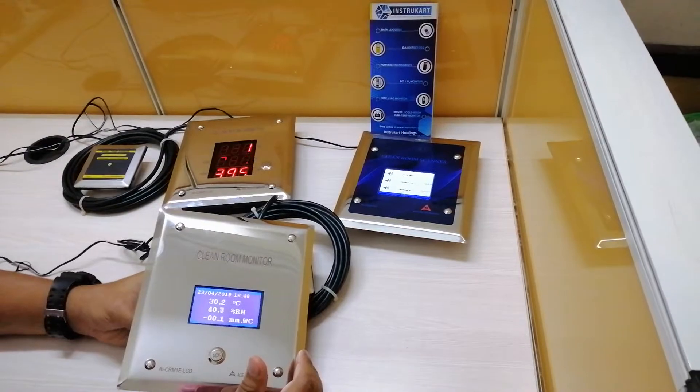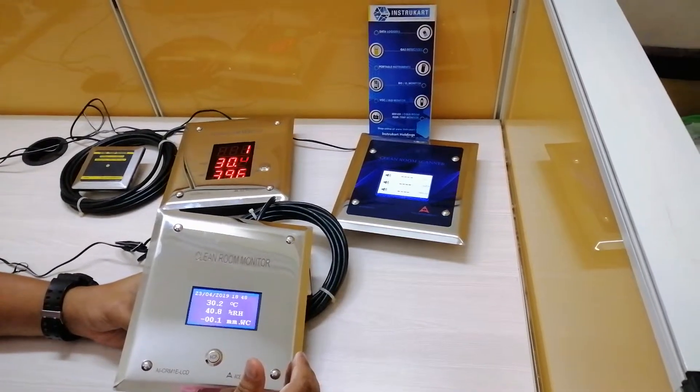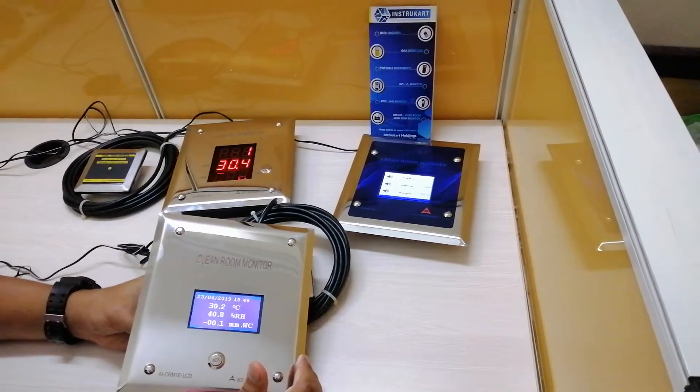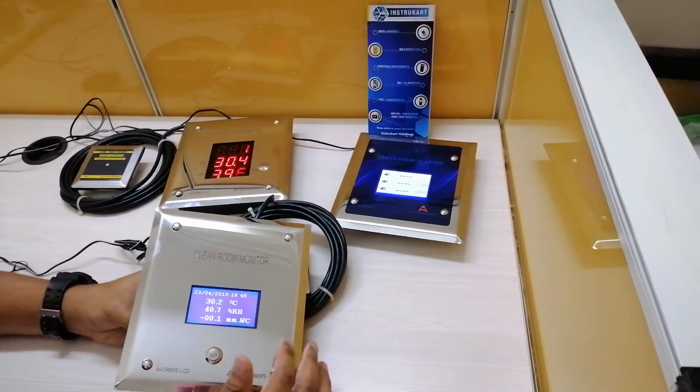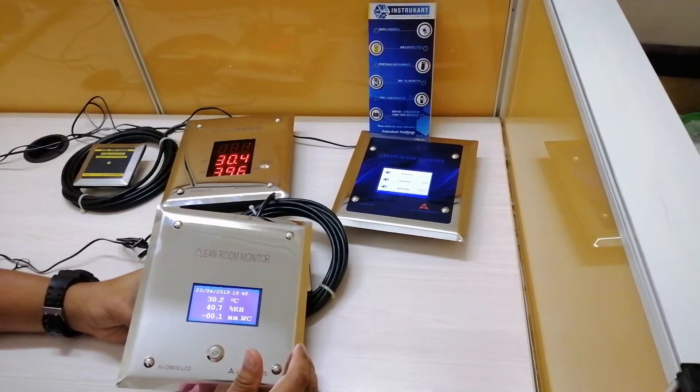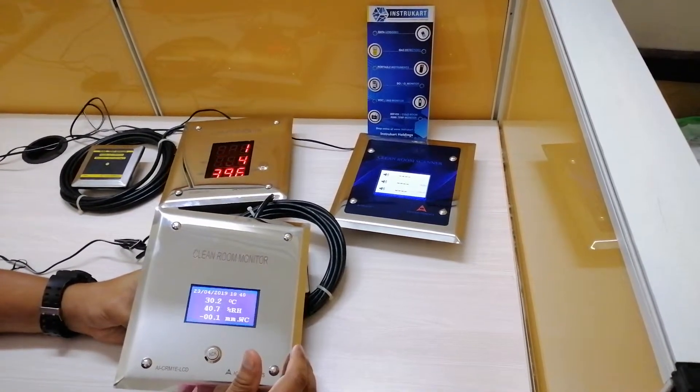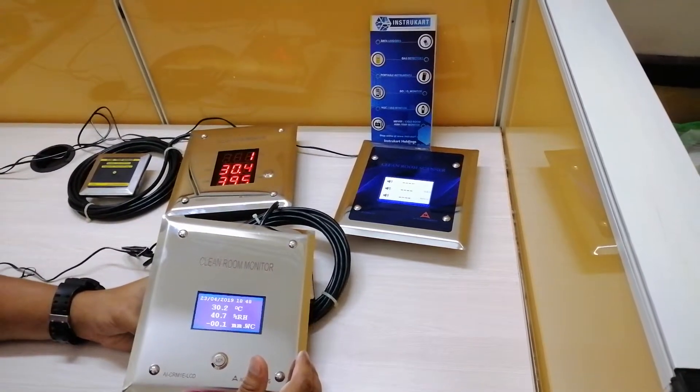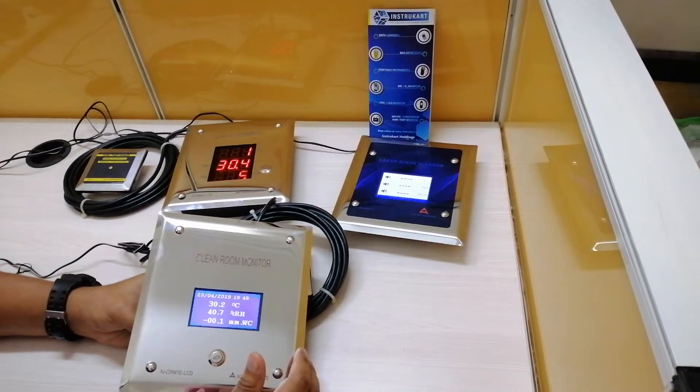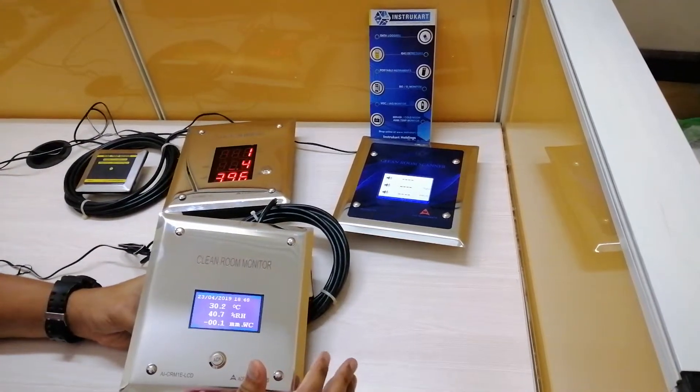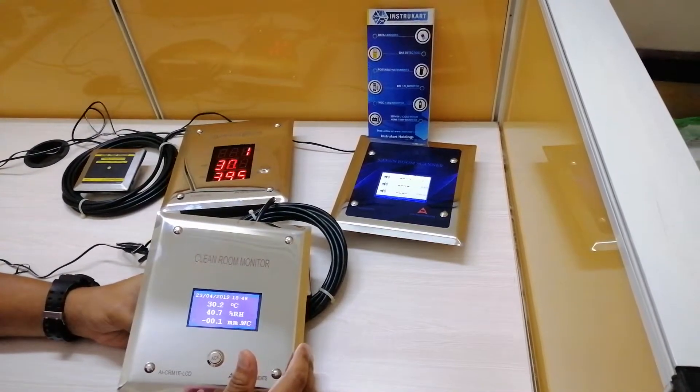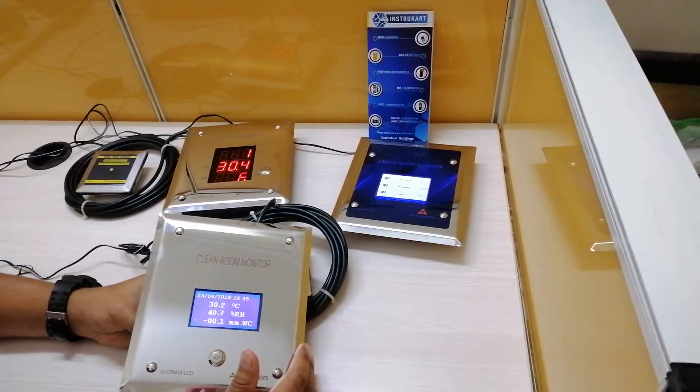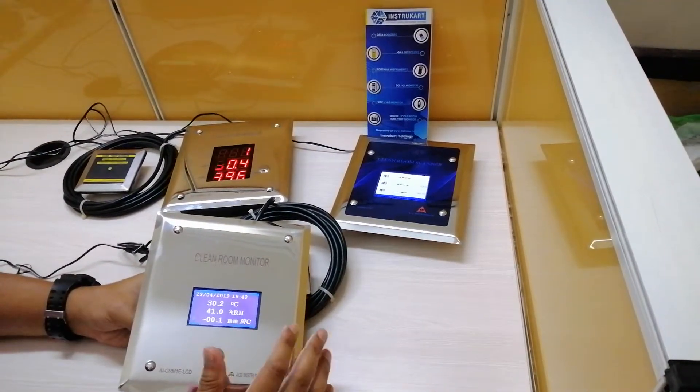The temperature has an accuracy of plus or minus 0.5 degrees Celsius, the RH has 1.8 percentage, and the differential pressure has plus or minus 0.5 percent on full scale.